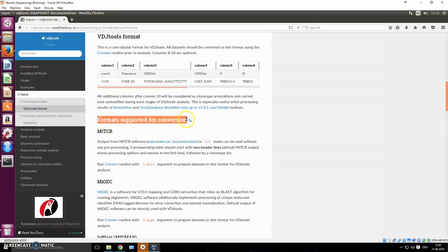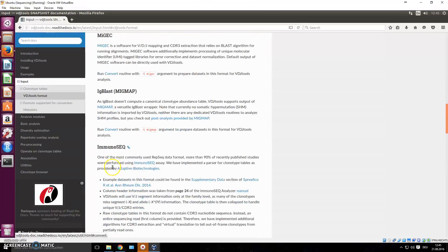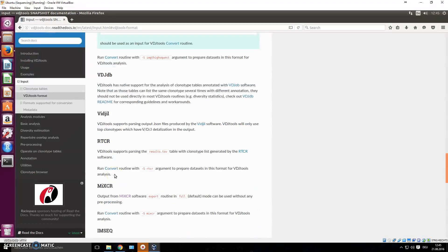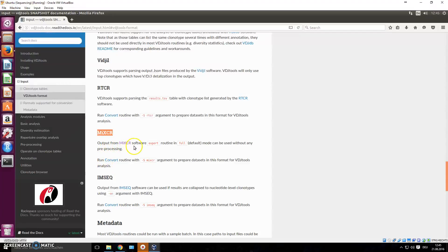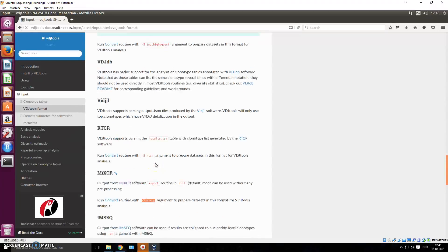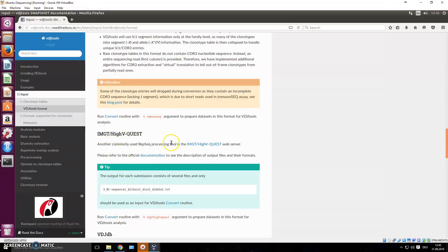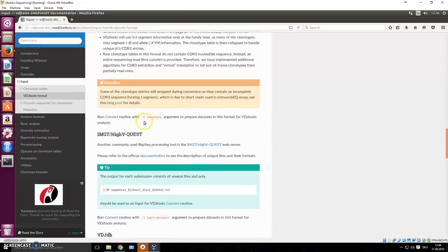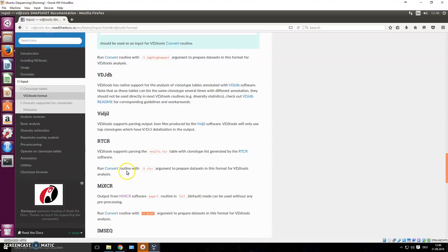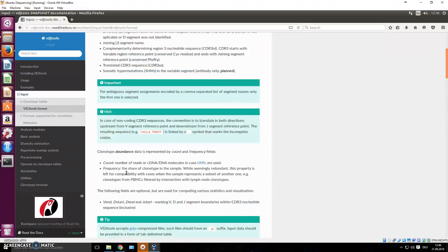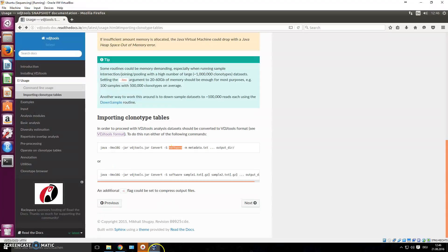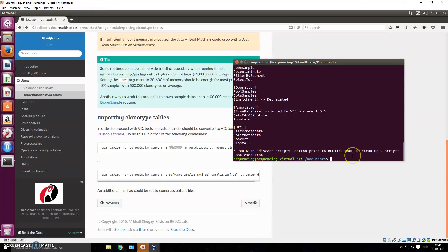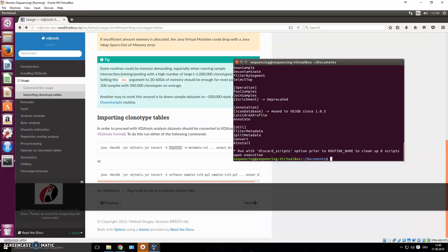We click on the VDJ tool format page — it shows supported formats for conversion. MiXCR is listed right here, so to run the convert command you type the option '-s mixcr'. IMGT works too, so you can also use the IMGT converter. Let's go ahead and do our MiXCR conversion now. We'll use the command syntax shown at the beginning, so we open up the tools and navigate to our folder.